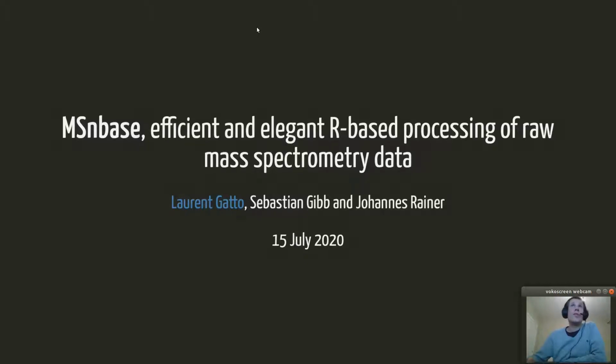Today, I'll be presenting how the latest version of the MSnbase package can be used to efficiently handle raw mass spectrometry data. So let me start by providing a little bit of background about the software.